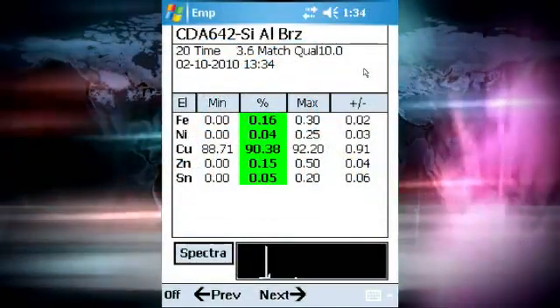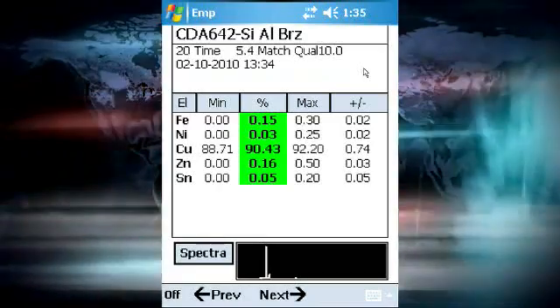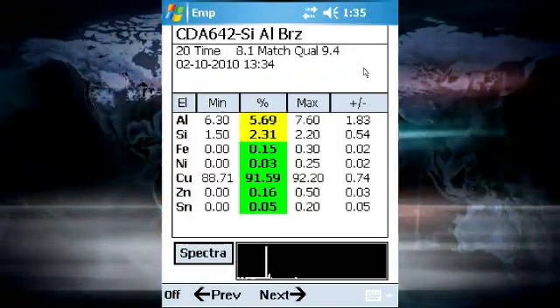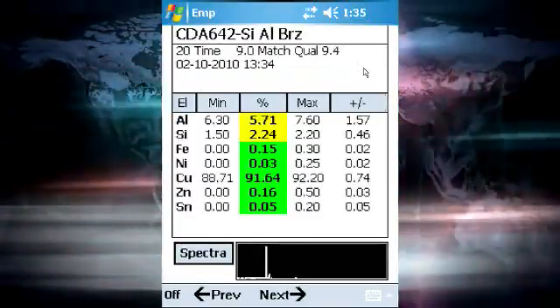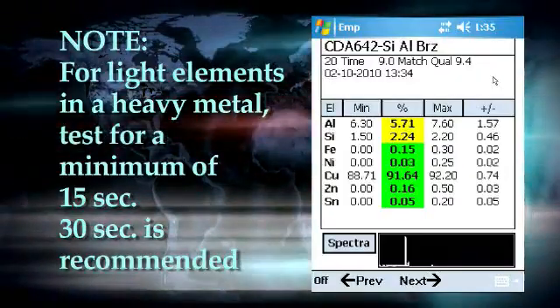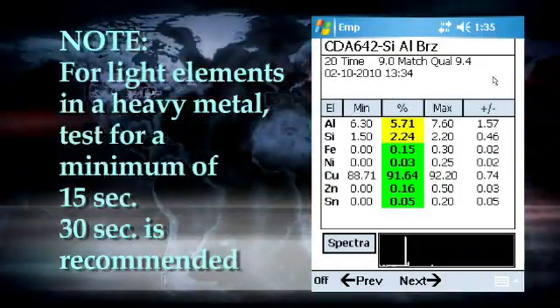The dual mode on the S1 Turbo SD will measure a sample with two sets of measurement conditions. The first measurement will be for about five seconds, then the voltage, current, and filter will change to allow the measurement of light elements such as magnesium, aluminum, and silicon. This measurement will run as long as the trigger is activated. If the measurement is terminated before the switch to the second condition, no light elements will be reported. In order to measure light elements in a heavy metal matrix like steel or copper, a minimum measurement time of 15 seconds is required.